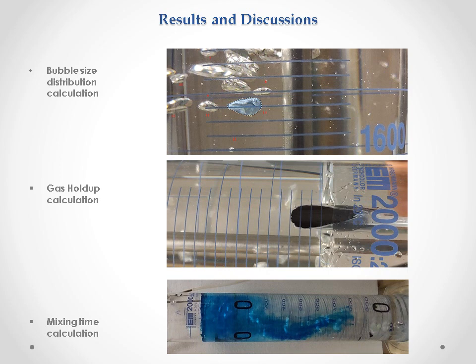The mixing time can be obtained by injecting the blue food dye in the reactor, while previously working under a set parameter. The difference between the start of the injection time and the homogeneity time is called the mixing time.